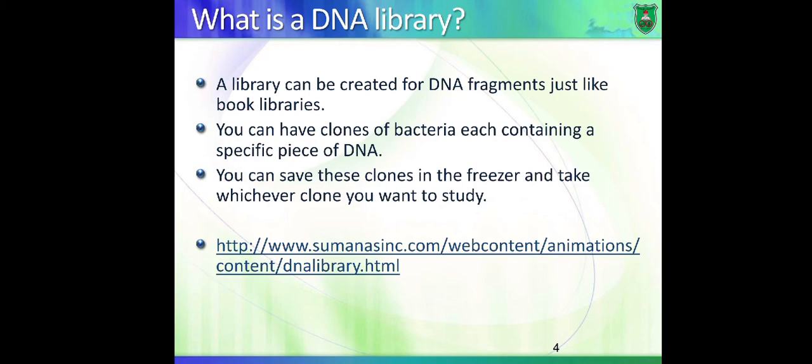Same thing with the DNA library. So basically, it is a bunch of plasmids. Each one of them contains a certain DNA insert. And we keep these plasmids either inside bacteria or as purified plasmids, and we keep them in the freezer.